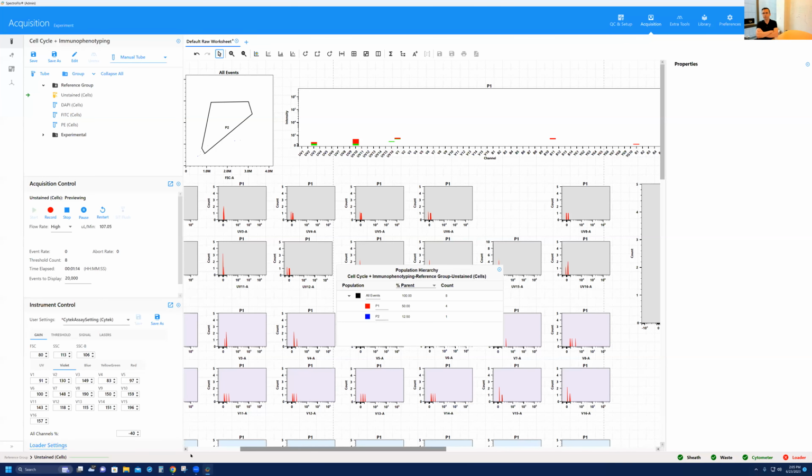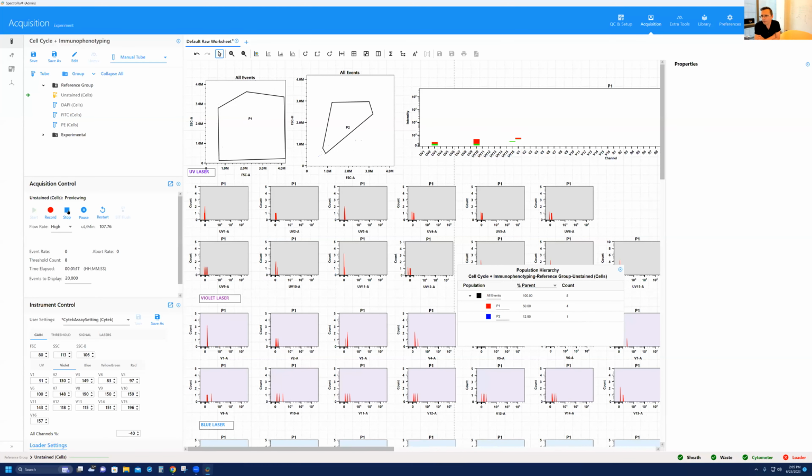Yes. Thank you, Kathy. But there's another question. Actually, it's related to gating. I mean, we've addressed this in previous sessions, but if you can just answer quickly. So someone is asking, how do you decide on the shape of the gate? Is it recommended to have a strict gate around the population or a very relaxed one?